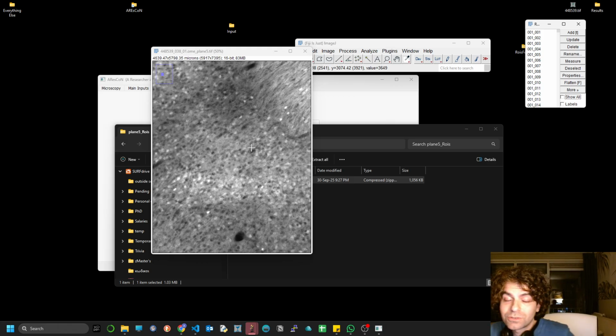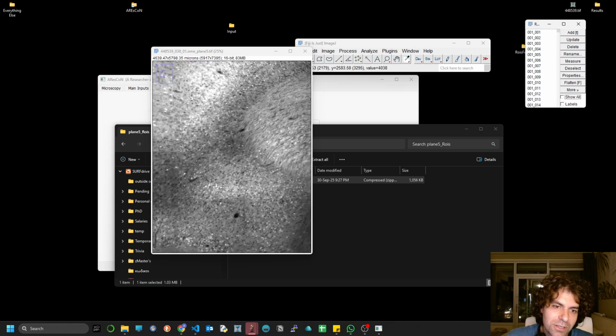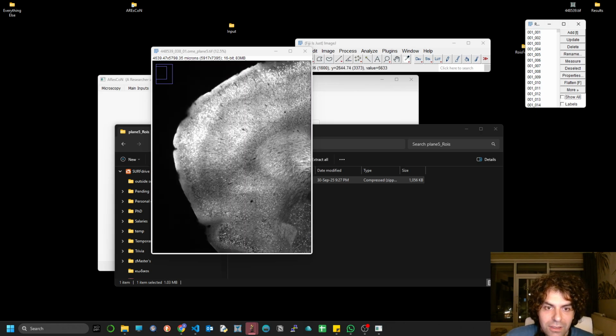What we also are going to do with AResCoN is that in the end we're going to keep the crispest version only across different planes, which is quite cool if you ask me, and that's what I wanted to achieve in the end. Okay, cool.